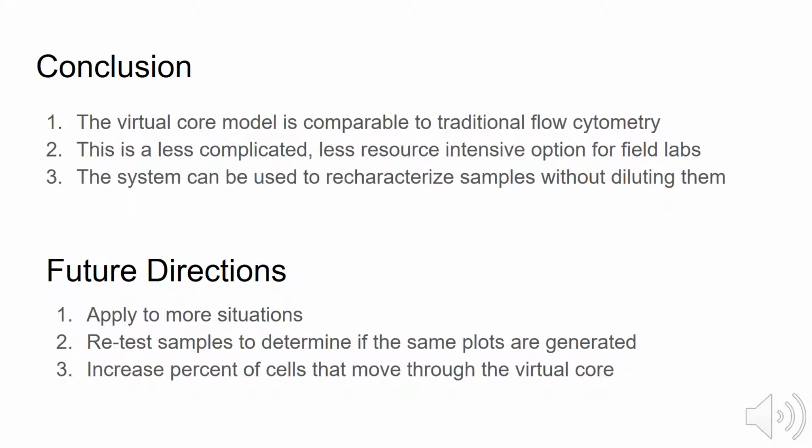So in conclusion, the virtual core model is comparable to traditional flow cytometry. This is a less complicated, less resource-intensive option for field labs or low-resource settings, and the system can be used to recharacterize samples without diluting them.